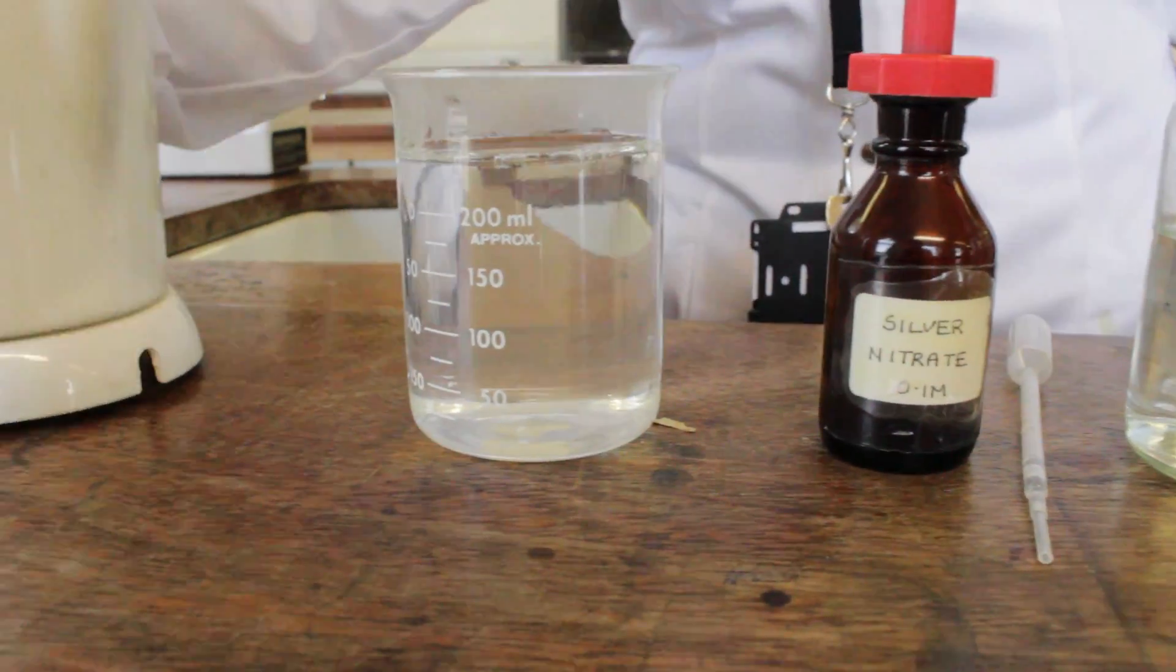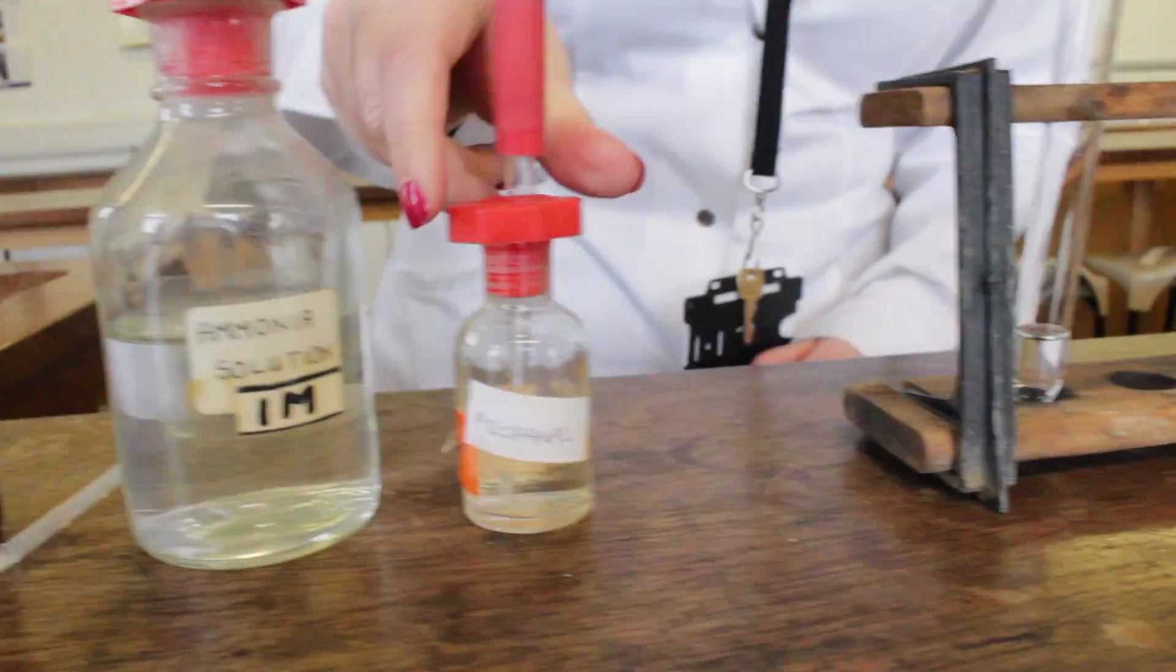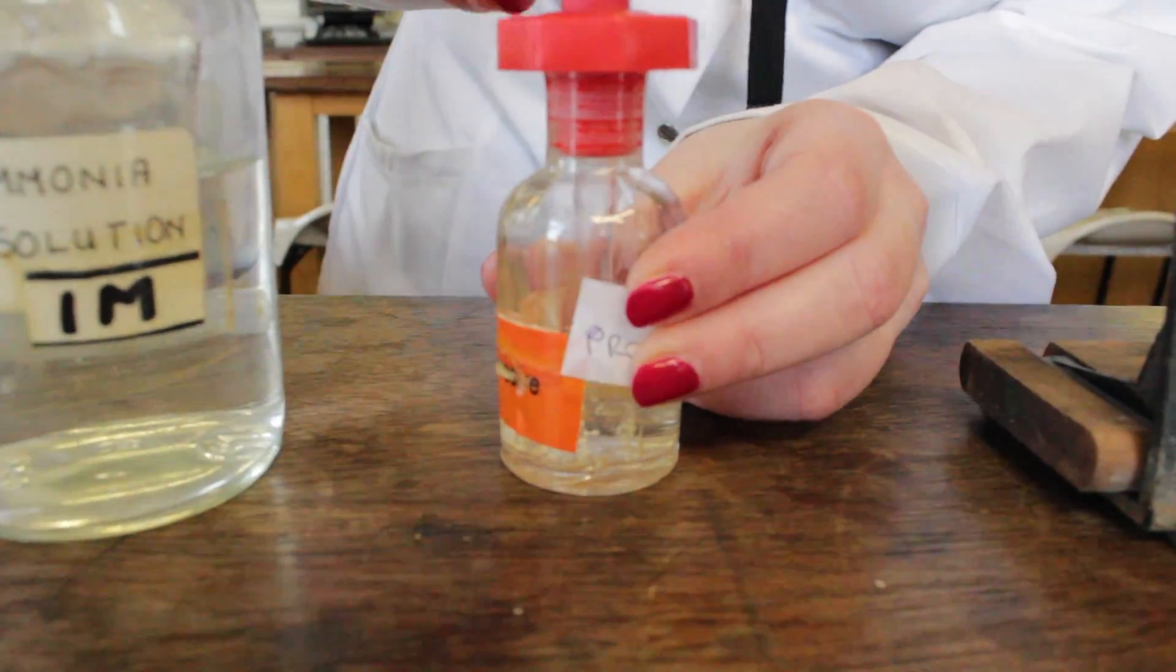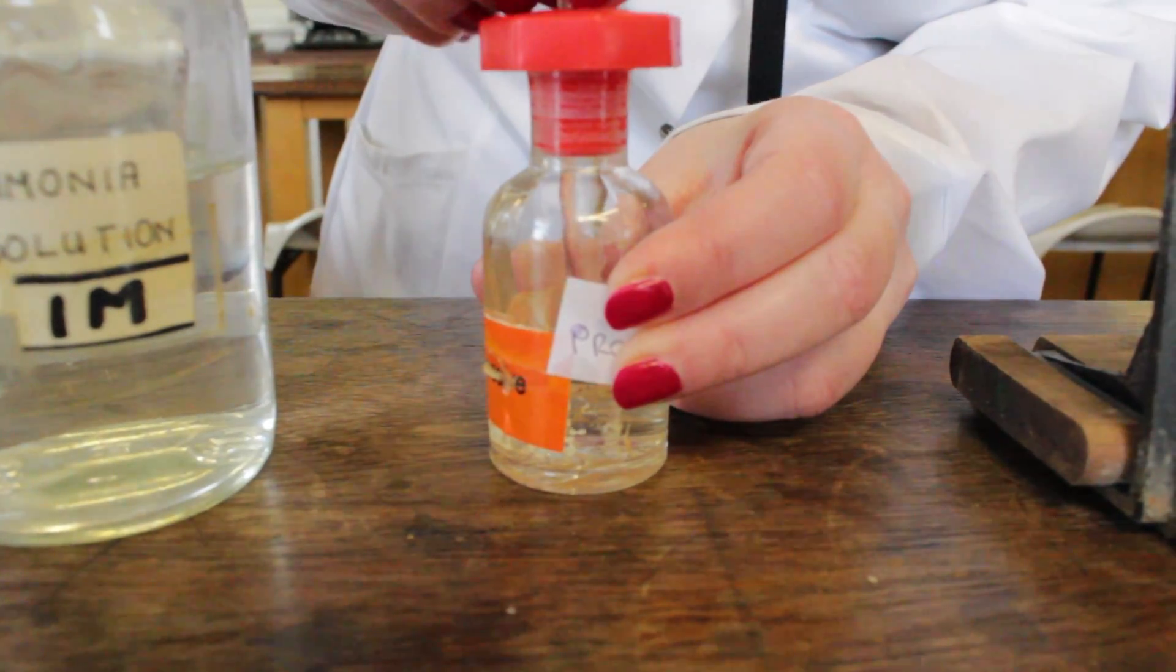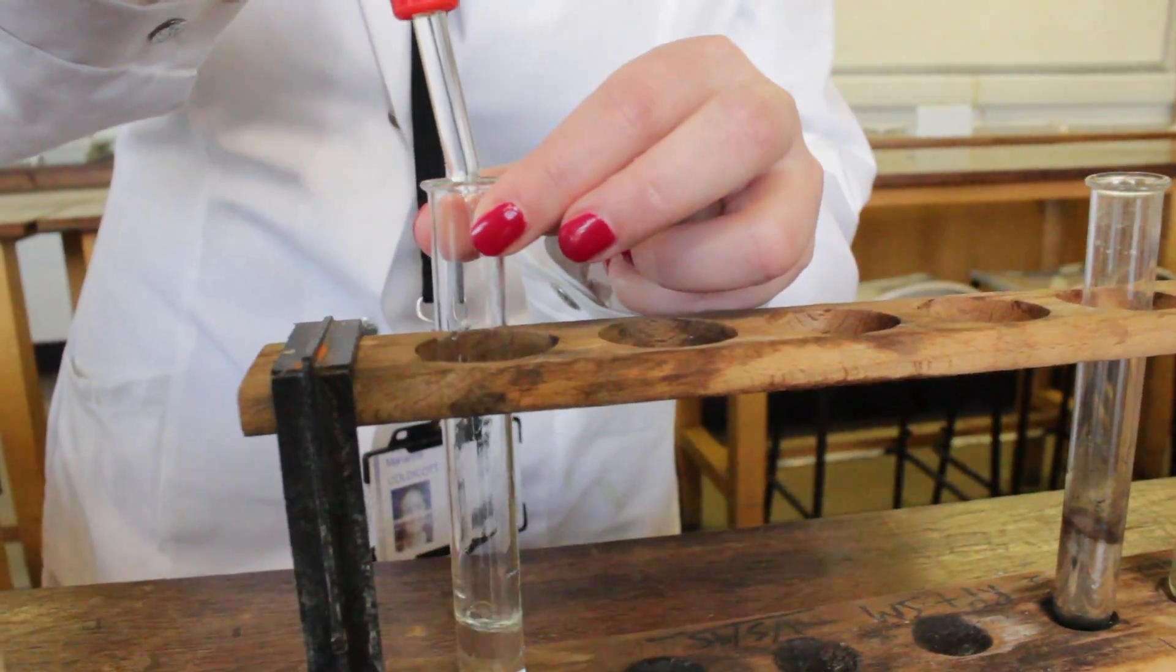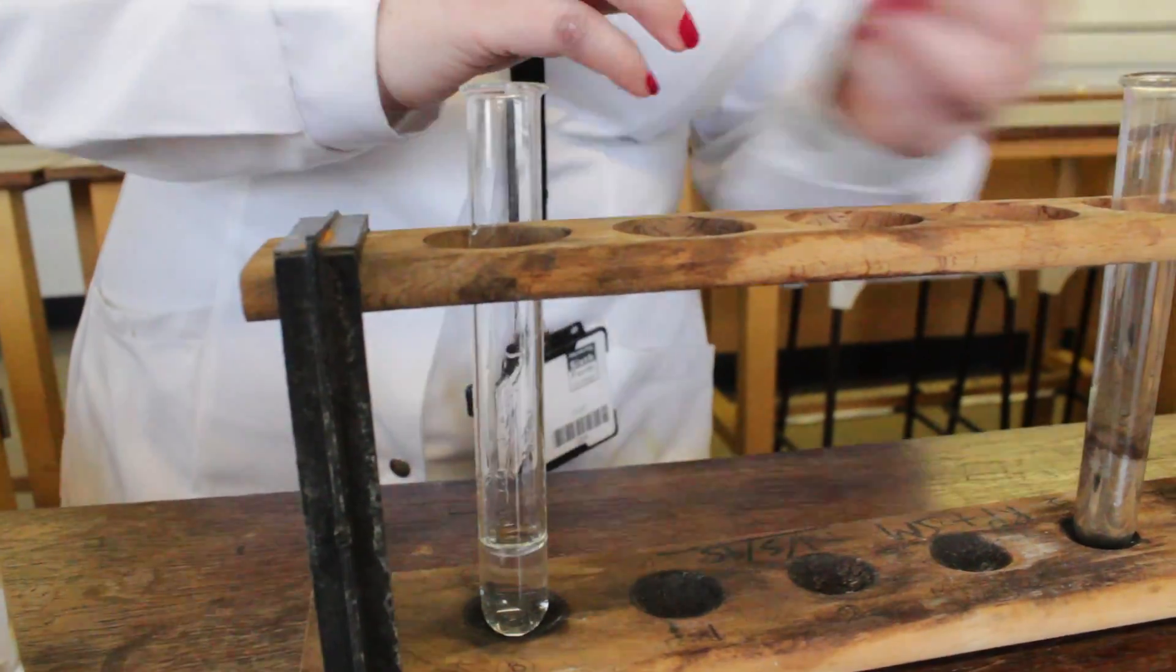So, boiling water ready in our beaker. We now take our propanal. You want to add about 10 drops and you need to add these quickly. Quickly, bung on, give it a good shake, place in the water.